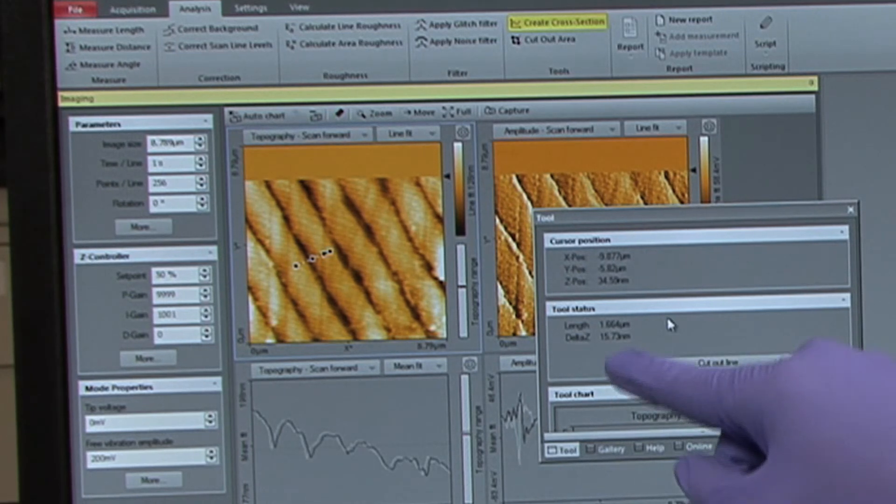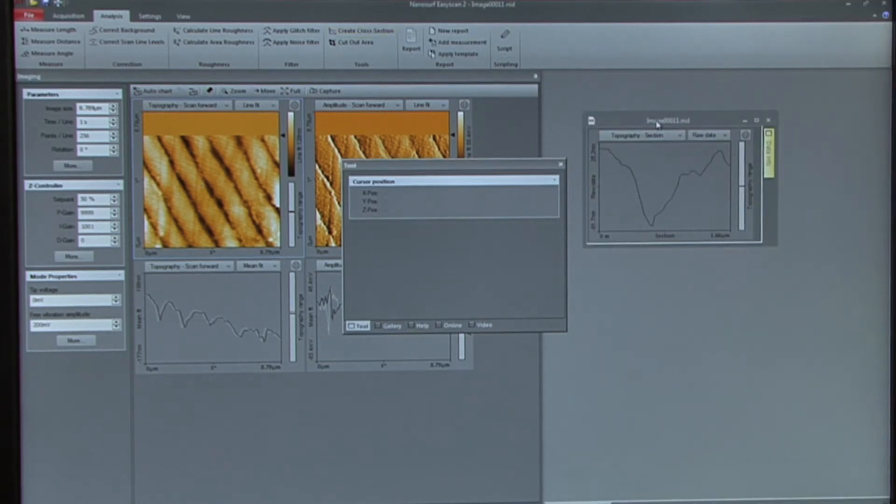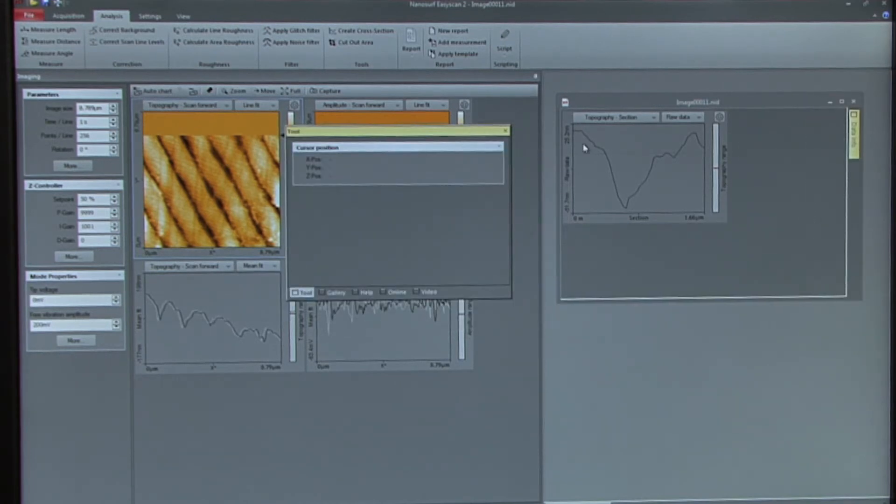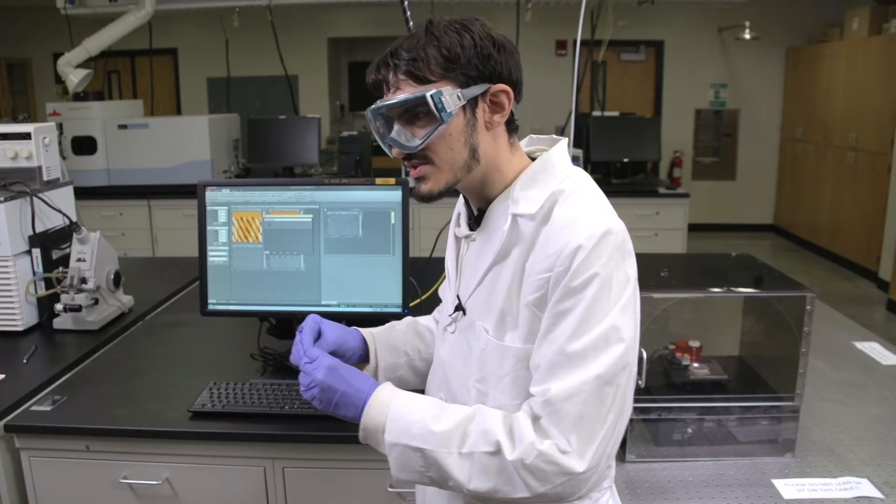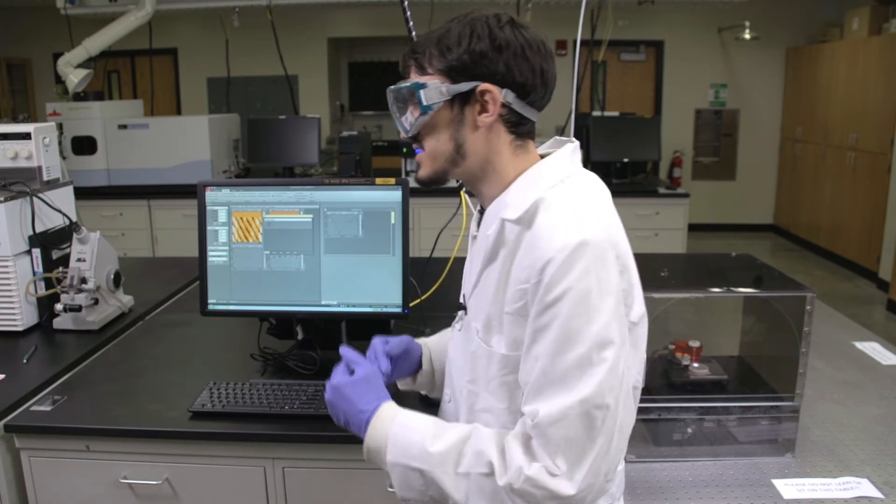You'll notice on the tool status, where it says delta Z, it is averaging the height of the features within this given area that you've clicked on. When you click cut out line, it will create an image, and you'll be able to see the topography as a cross section. You'll want to do this for several areas and several ridges, and write down the numbers of delta Z in order to get an average for these values.